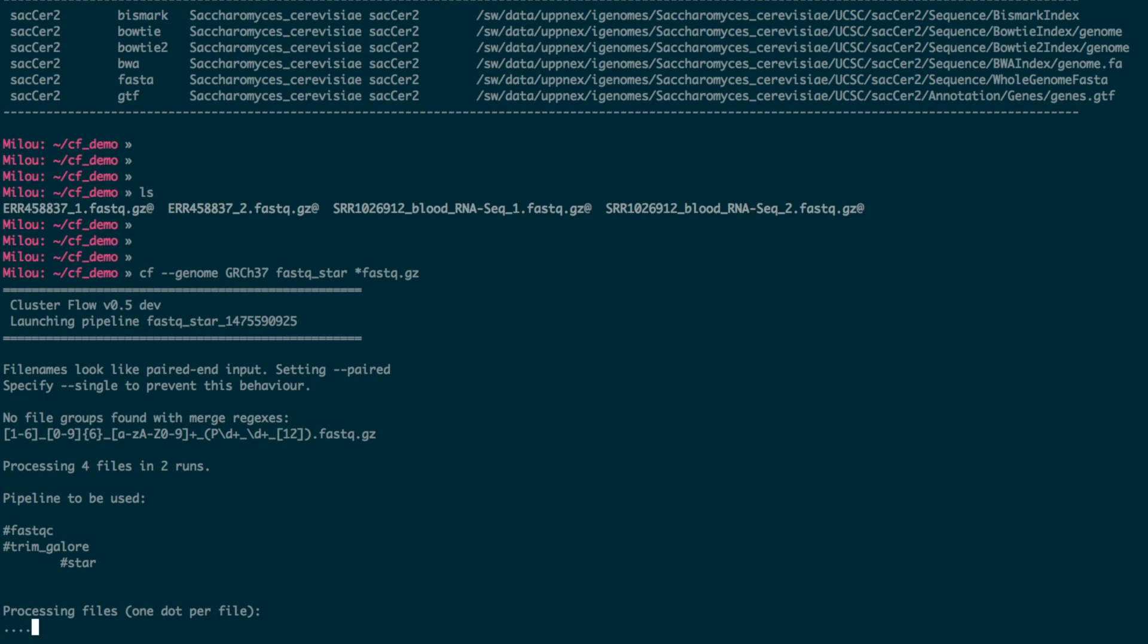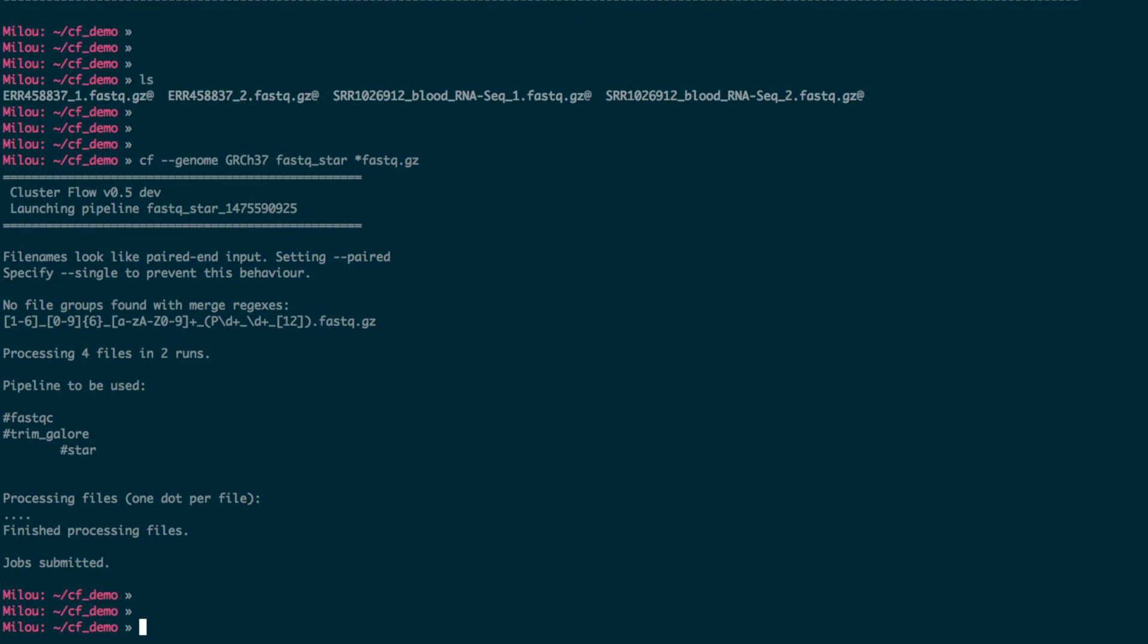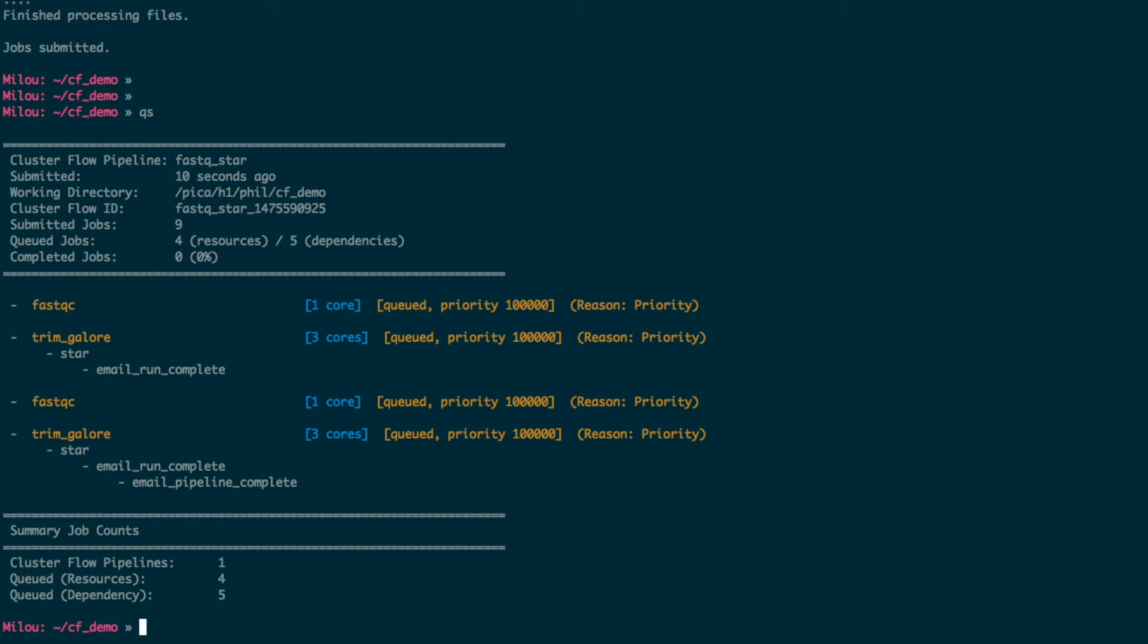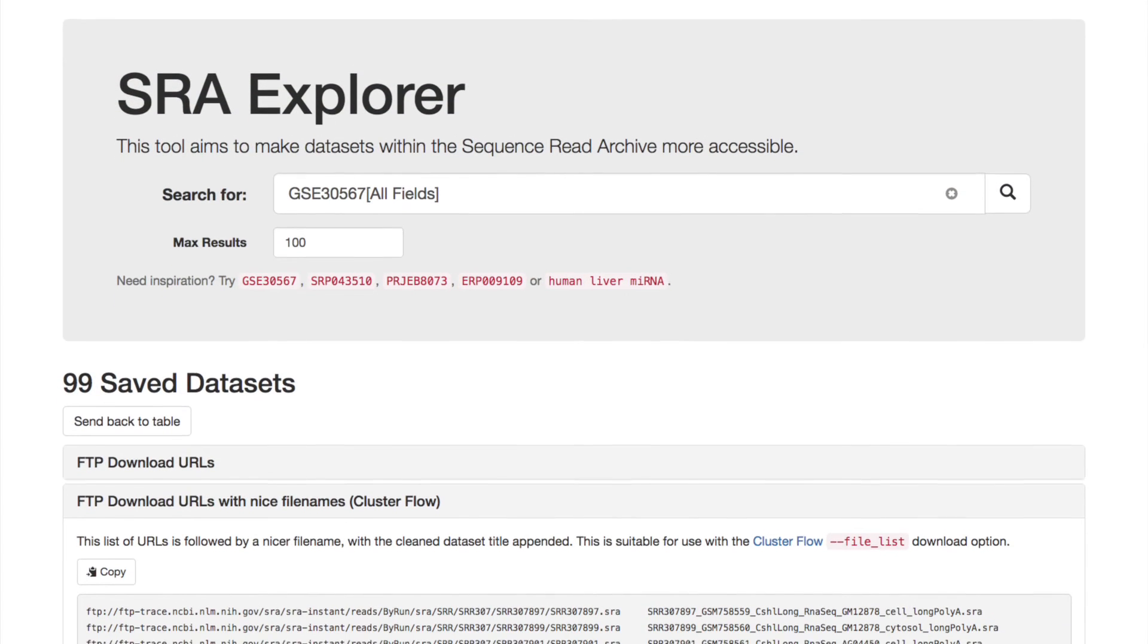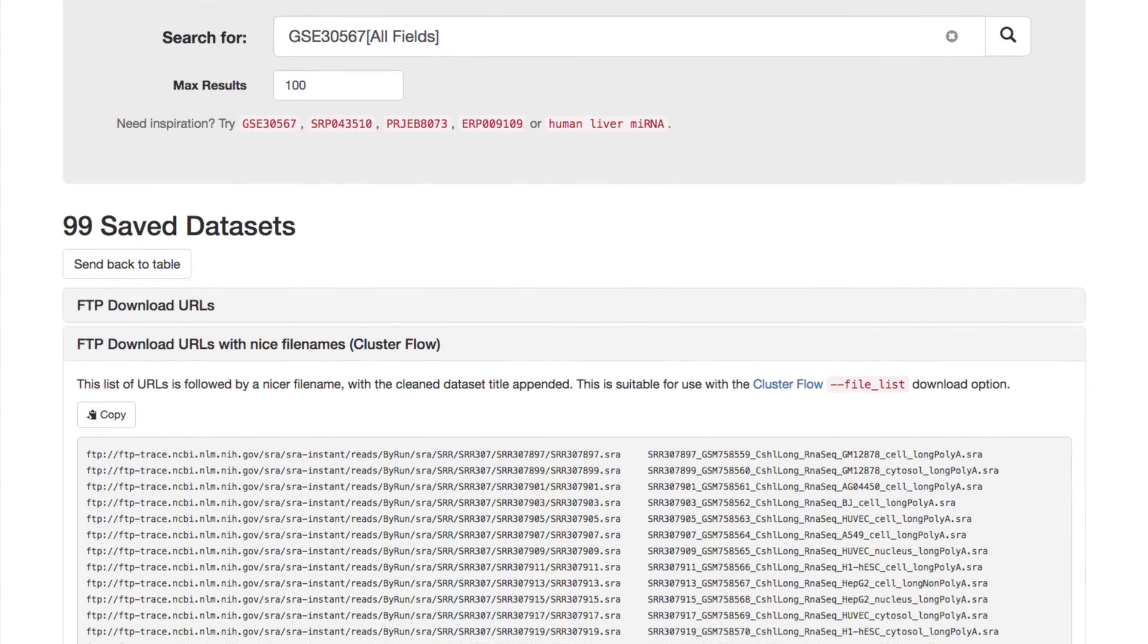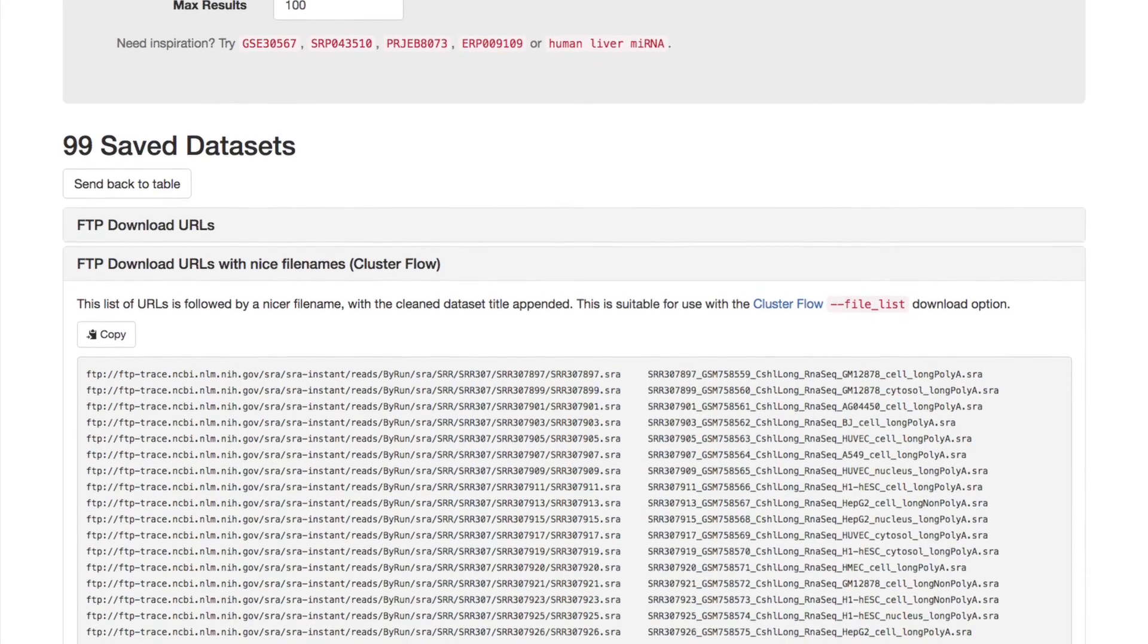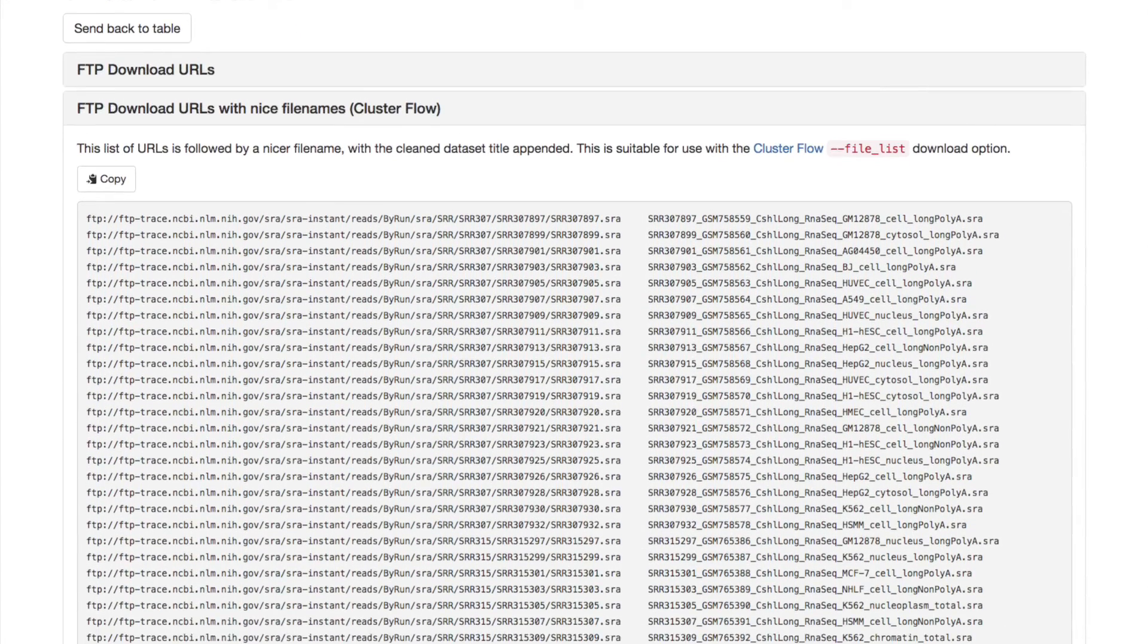You can add regexes which will recognize and automatically merge multiplexed samples and files before analysis starts. And if you provide Cluster Flow with URLs instead of file names, these are recognized and downloaded, so you can download and analyze public data in a single command.